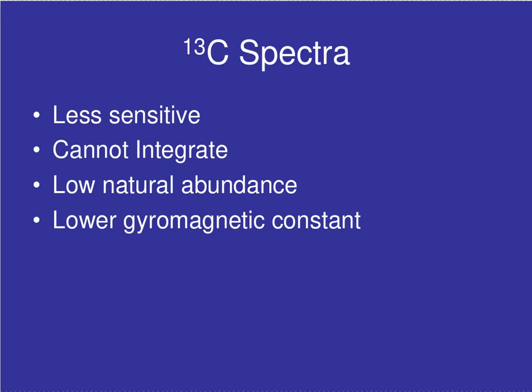Right, we've dealt with proton NMR spectra to this point, and we've dealt with aspects of chemical shift, of the integration, and of the splitting, and how we interpret these three aspects in exploring proton NMR spectra. But I'd like to now move on to carbon-13 spectra, and just to make you aware that carbon-13 is less sensitive because carbon-13 has a lower gyromagnetic ratio than the proton, and also carbon-13 is only 1% of all carbon that's found naturally.